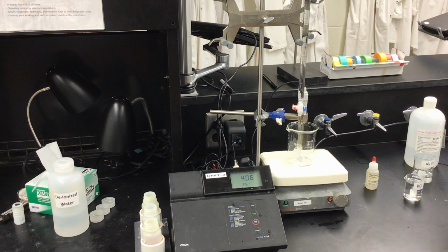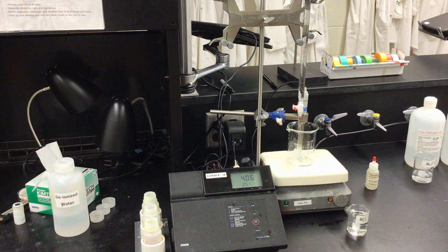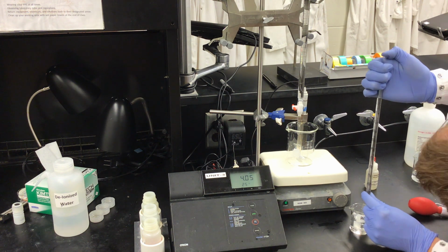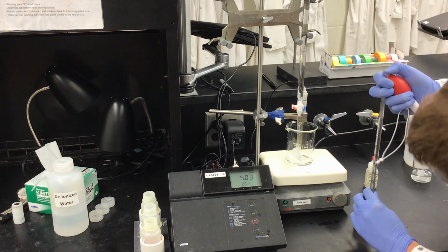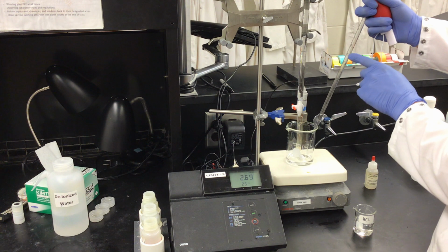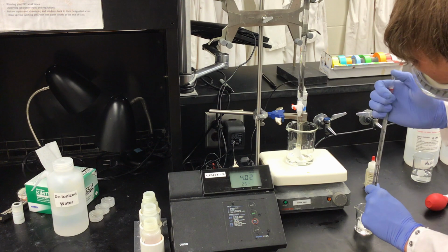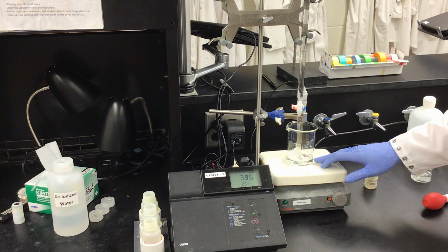So now I can go ahead and take my unknown hydrochloric acid, and I can add 25 mL to my 250 ml beaker using my graduated pipette. Cap it with your thumb in order to control the rate at which you lose solution. And now I will first add 10 milliliters, and then I will need to add my second 10 milliliters. And remember, the tip is included in the total volume here, so we do not need to stop at the 1 milliliter mark. We can dispense the entire volume of our graduated pipette. And then lastly, we just need 5 milliliters. And now we have 25 milliliters of our unknown hydrochloric acid inside of our beaker.